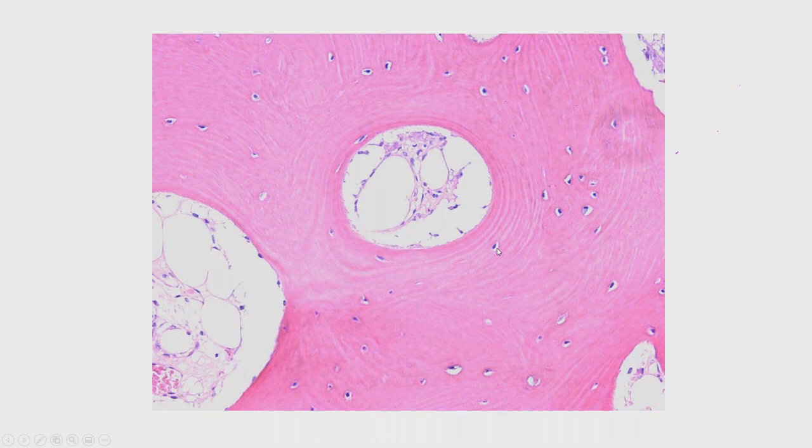You can very well see the lacunae, these white vacuoles or surfaces here. You can see the osteocytes inside with their dark blue nuclear staining. Within the vascular system, this big white circle, you can actually see the hematopoietic cells. This is in the vascular system. So this gives you a very good example of what you want to see.